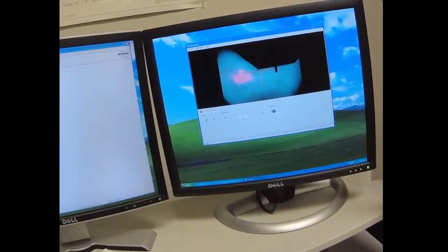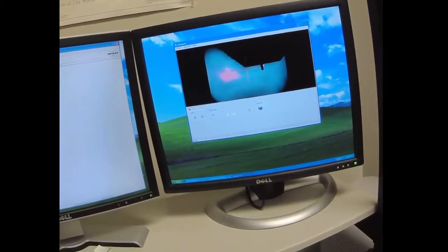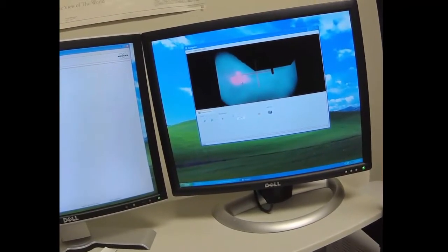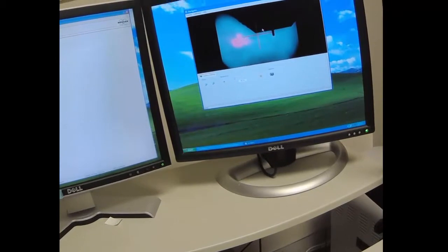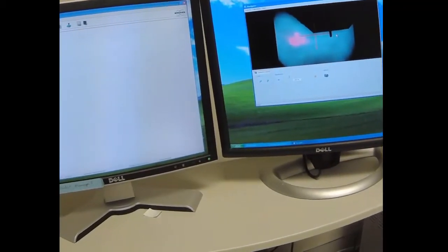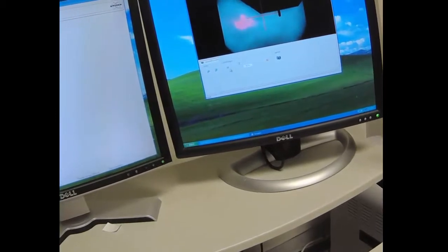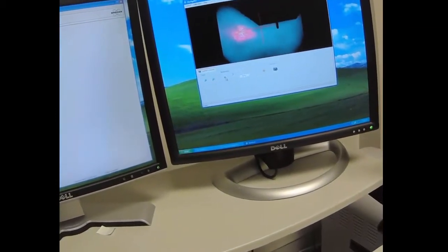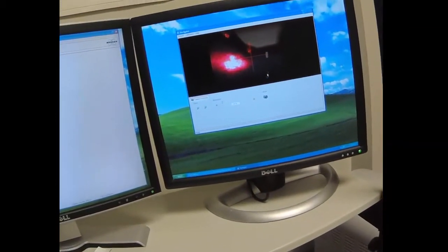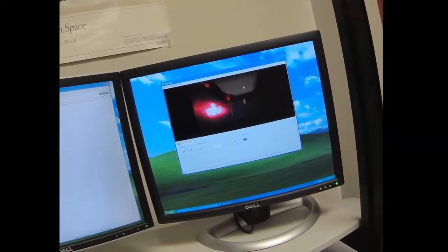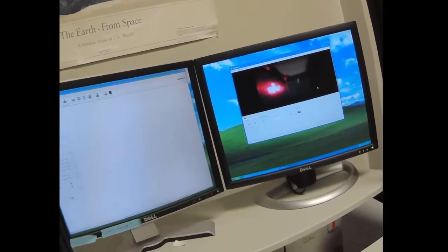The laser spot is to the left of the cantilever. So we don't want to get wild moving the alignment mirrors around. I like to turn off the light so I can see just light from the laser. So it helps me see what's happening.